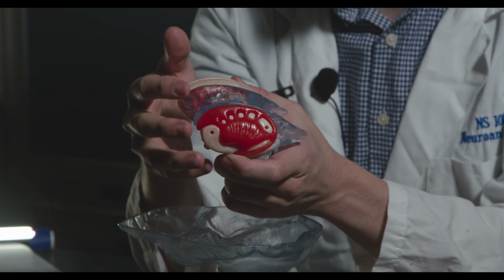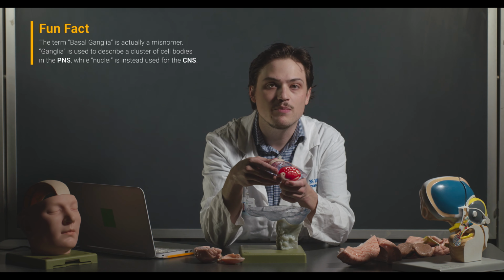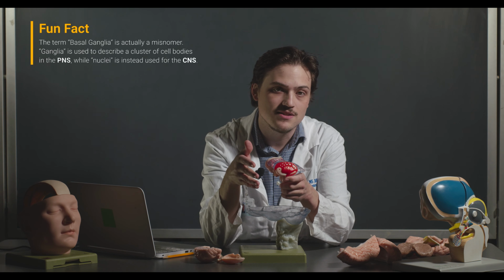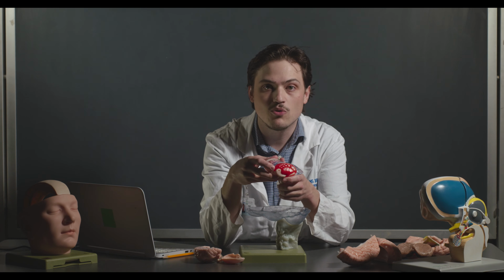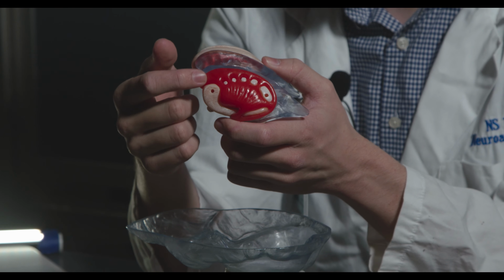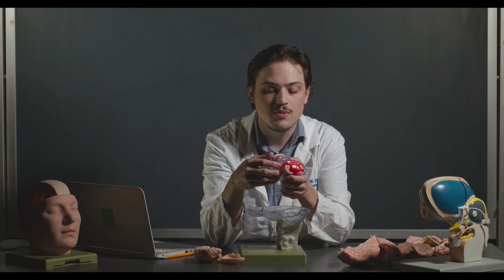The basal ganglia is essentially involved in movement disorders, permitting movement and inhibiting movement and so forth. You probably hear it when you talk about things like Parkinson's disease and Huntington's disease in the 101 series. If you've taken 101A yet, you'll talk about it more extensively there and maybe a little bit in lecture. But when they refer to the striatum in those disorders, they're really referring to the caudate and the putamen. I'll go through why they get that name in a little bit.